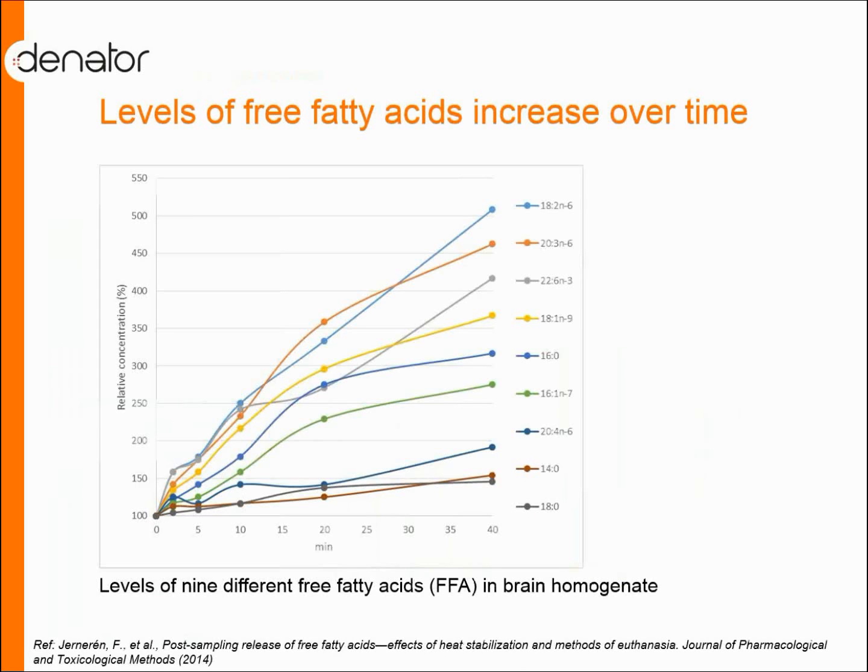Looking at fatty acids, this is the same image as earlier. I just want to highlight it again and emphasize that we have an ongoing situation with enzymatic activity in the sample releasing free fatty acids from the triglycerols primarily.